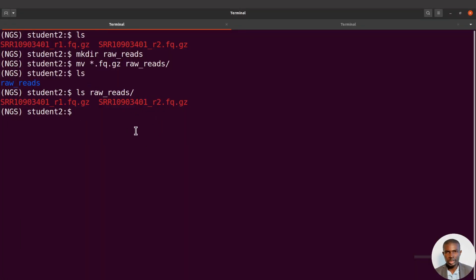Now, if you have your sequence data, it's important to perform quality control. So it's important to assess the quality of the data before you do any processing, before you start the analysis. All right, you can use tools like FastQC to do that. But for this tutorial, I'll skip that because the focus of this tutorial is to show you how to remove the human reads. But if you have your own data, make sure to perform quality control, assess the quality, and then you can identify potential issues, and you can resolve them before you start the actual exercise. All right. For this tutorial, I repeat, I'm skipping the quality control, but under normal circumstances, we are supposed to do that. So take notes.